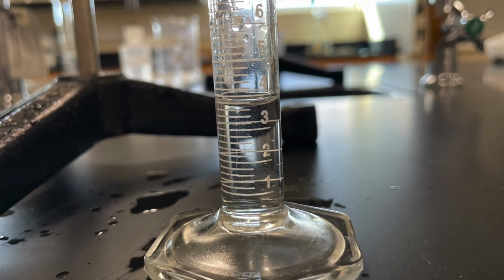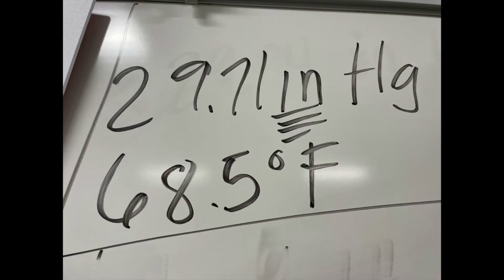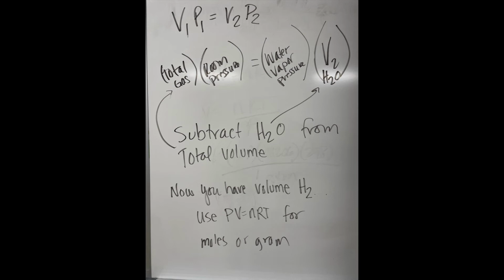And as we wrap this up, just a gentle reminder of those initial temperatures and pressures of the room and of the water, and a slight hint on how to solve for the volume of hydrogen collected.